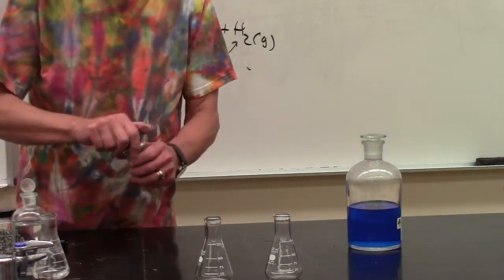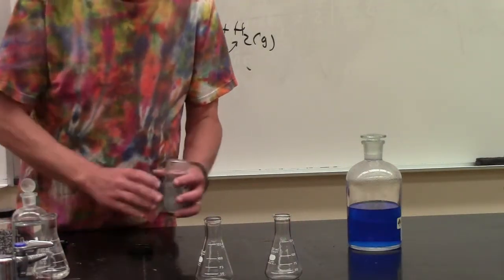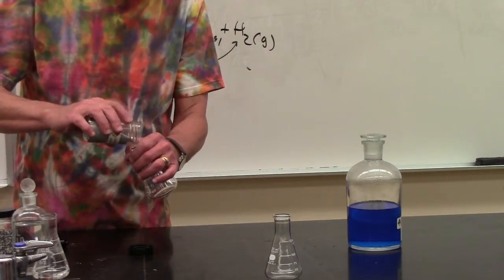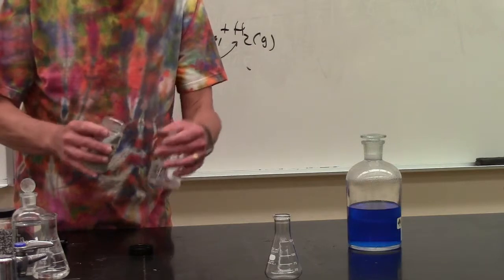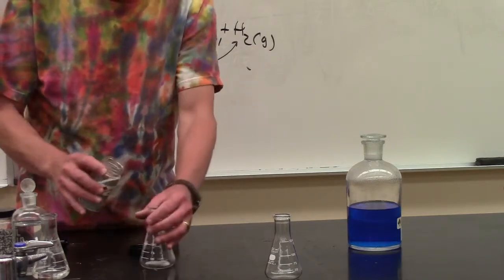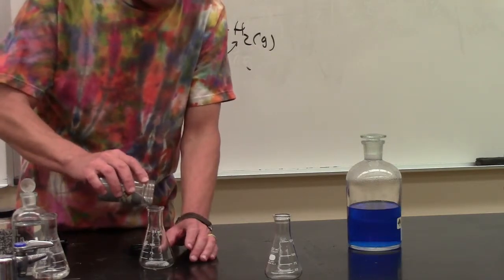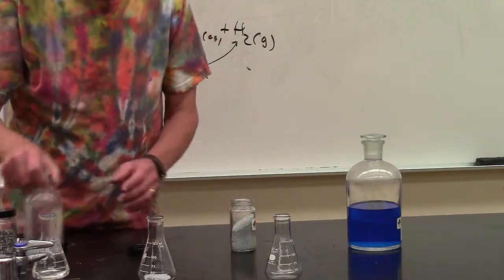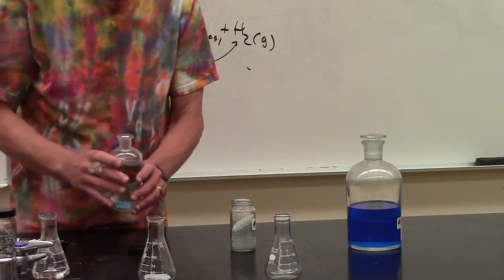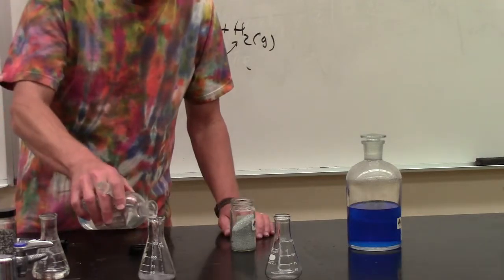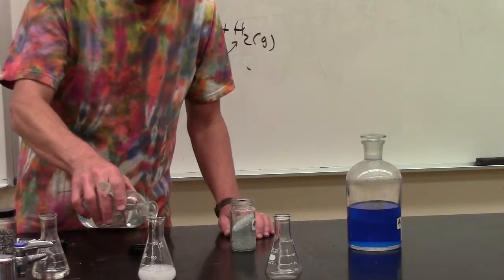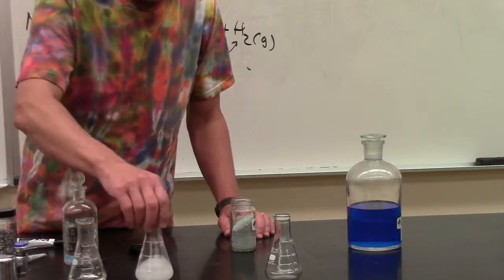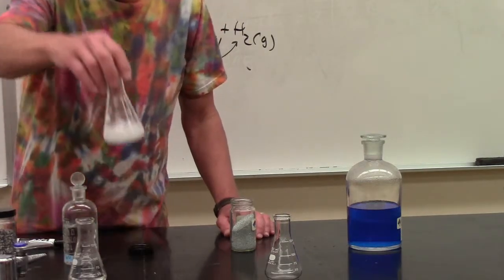Another common material is zinc. If you've ever heard of a galvanized pipe or a galvanized nail, that means it's coated with zinc. And again, we can put a little bit of zinc in this flask and add hydrochloric acid to it. Again, you can see bubbling, not quite as vigorous as the magnesium, but definitely bubbling for sure.